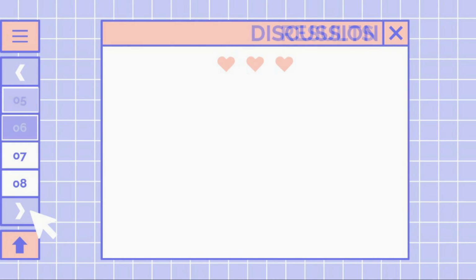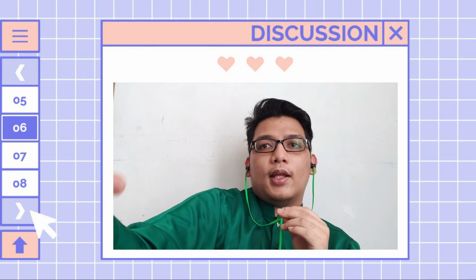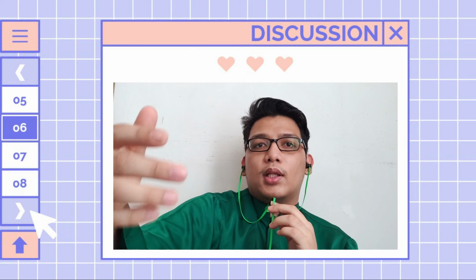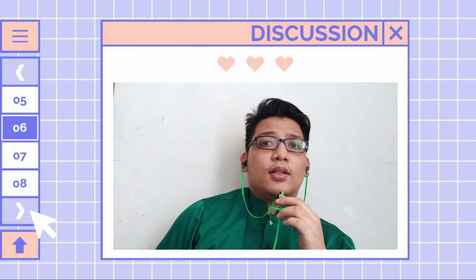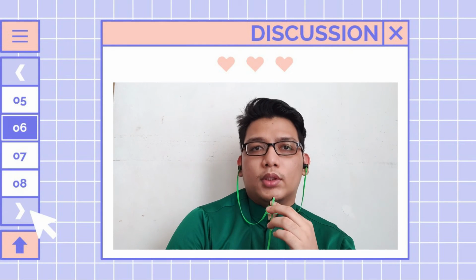The results of the experiment are represented in the graph of total number of floating leaf discs against the time taken. In this experiment, we'll be discussing, first, how does the suction help the leaf discs to sink? Leaves have air in the spaces between cells, which helps them to collect CO2 from their environment. The suction will help us to apply a gentle vacuum to the leaf disc in solution that forces the air out and replaced with the solution.